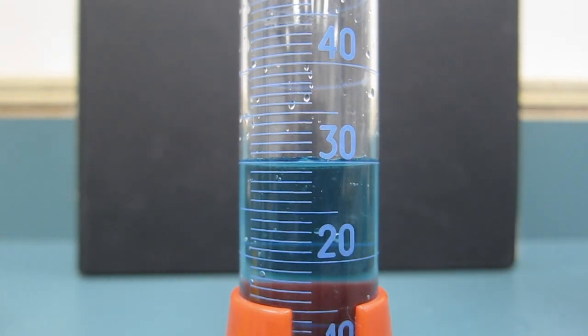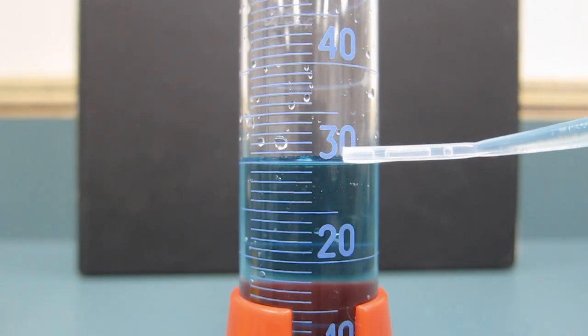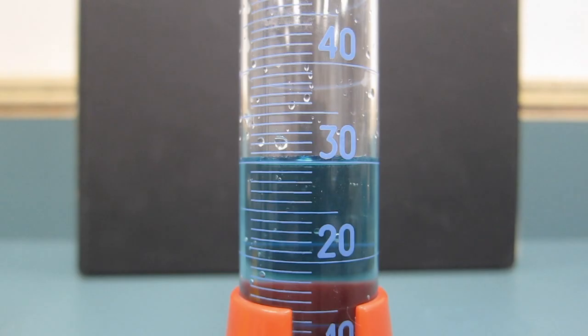And the bottom of the meniscus is just slightly underneath of that, actually. The biggest mistake people make is not getting at eye level and not reading from the very bottom of the meniscus. I could probably even go a tad higher. Notice that the upper part of the water is actually above the 30, though.